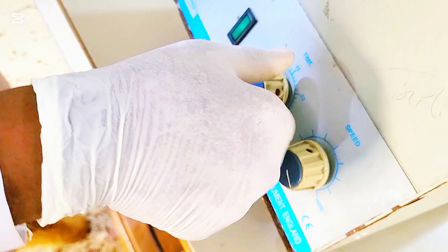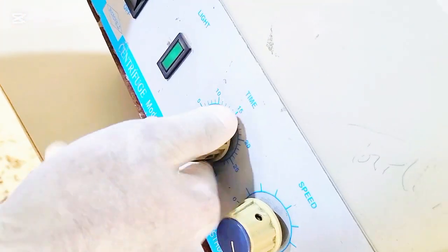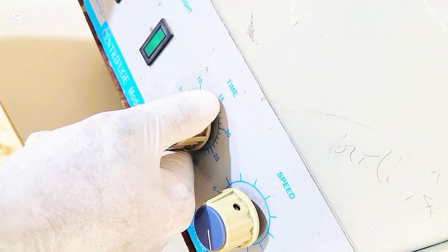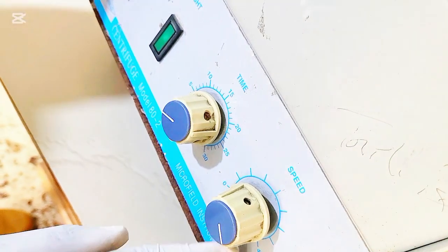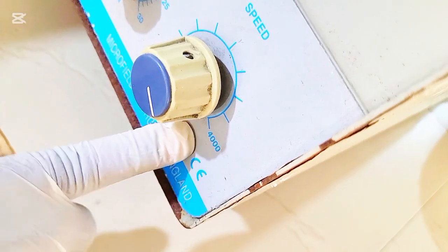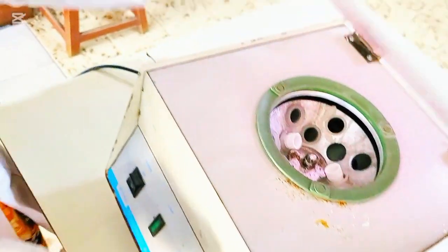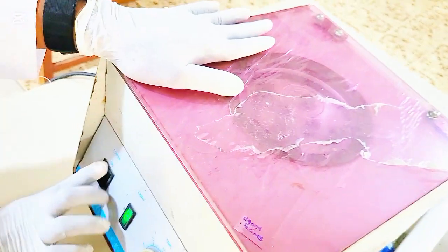So now we're going to regulate this to 1 minute. It's at 1 minute now. It's already at 3,000 RPM. This is for the speed, 3,000 RPM. Then we'll put it to 1 minute. And then, you see, like I said earlier, this is how you balance your centrifuge. You put them in opposite direction to balance the weight so you don't spoil your centrifuge brush. Then you close, then you put it on.